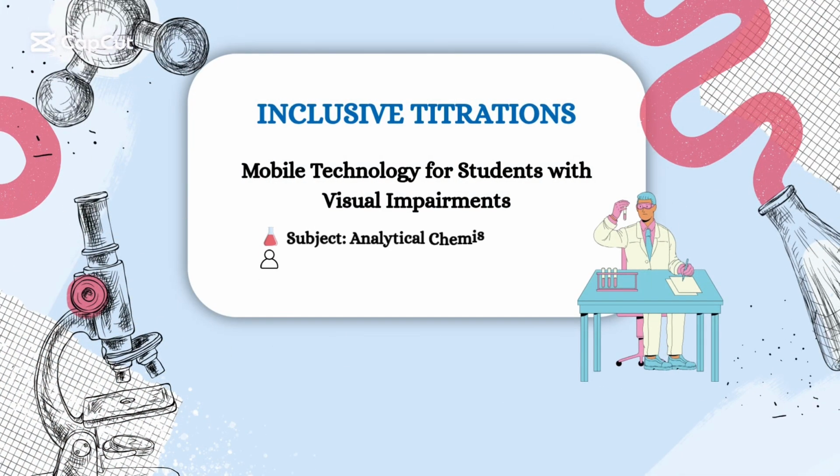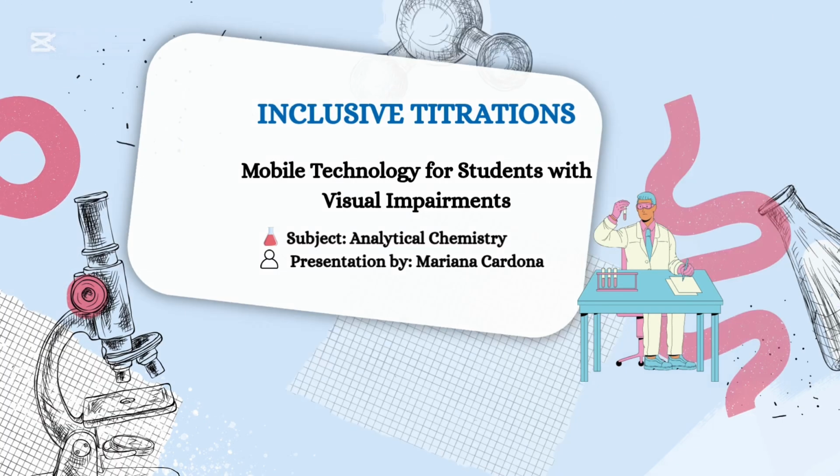Inclusive Titration's mobile technology for students with visual impairments. Presentation by Mariana Cardona Hinao, subject Analytical Chemistry.